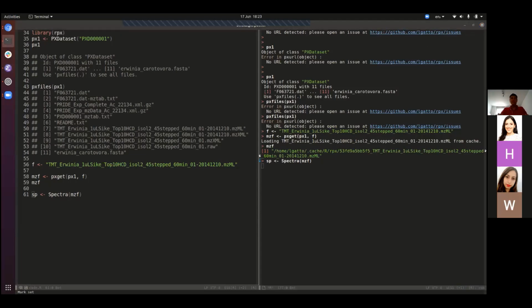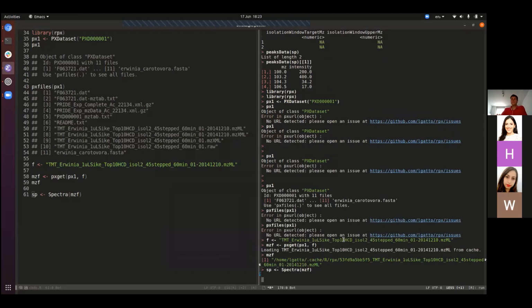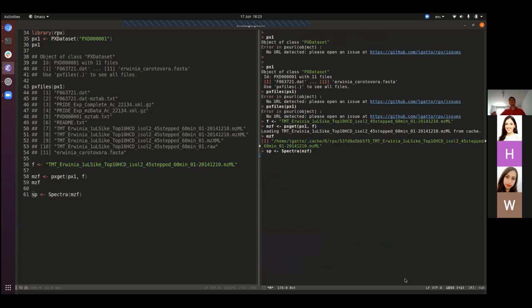So let's see, not sure why this takes a little bit of time. Okay. I'm sorry, I'm on my laptop here. I initially anticipated doing that on the desktop computer. And it's running Zoom, and I've realized that this slows lots of things down. This takes way longer than it should, but let's be patient.